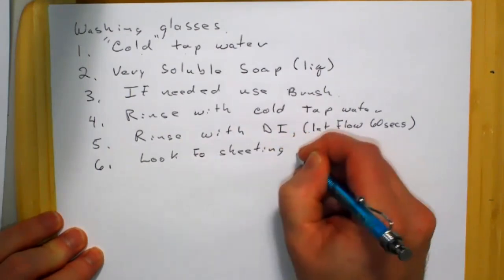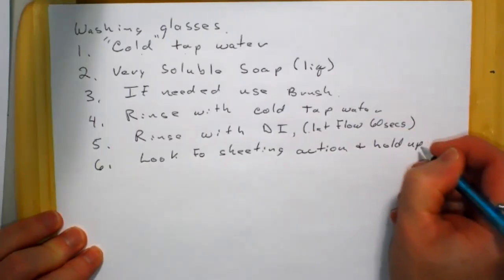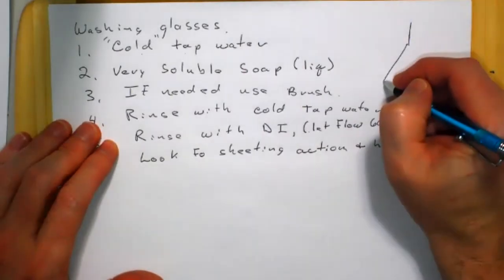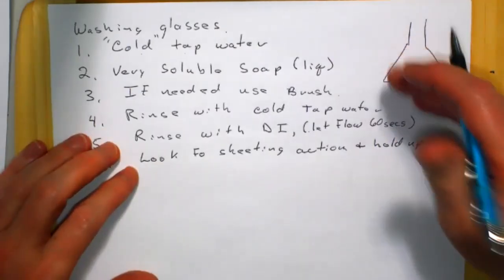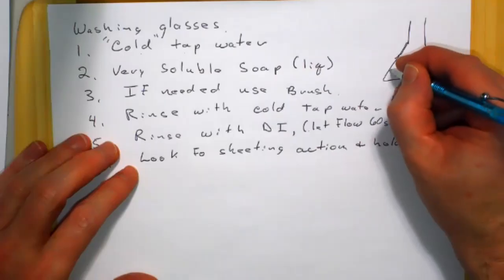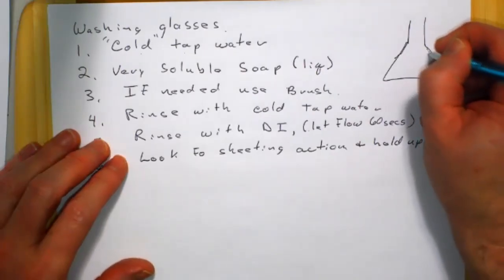So we'll look at sheeting action and hold up. Is the thing clean? If my flask has a, I'll dump it, it'll probably be upside down, but you'll see like a whole front. It will be either wet or dry, and that wetness will move towards gravity. Or you'll get, that's clean.